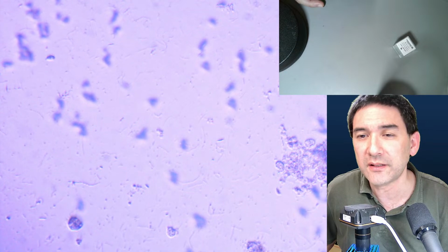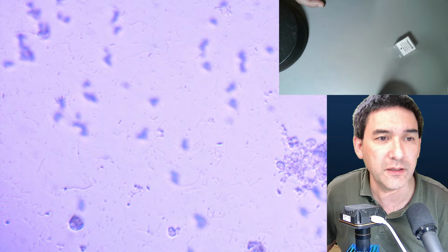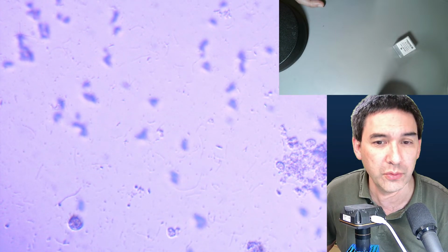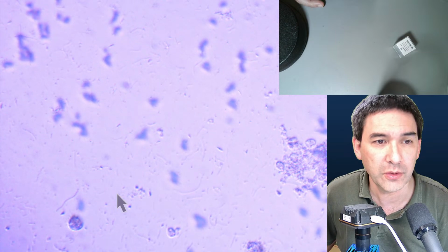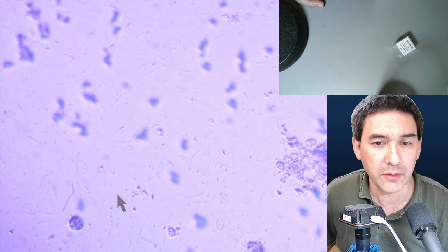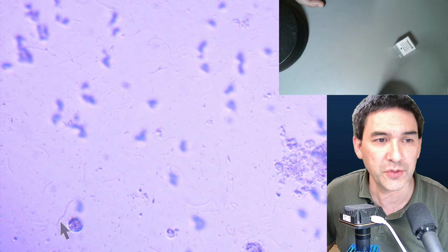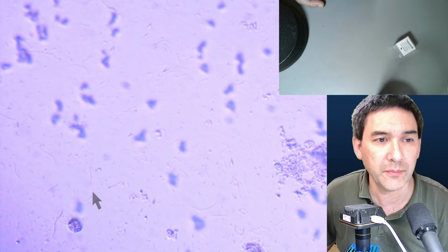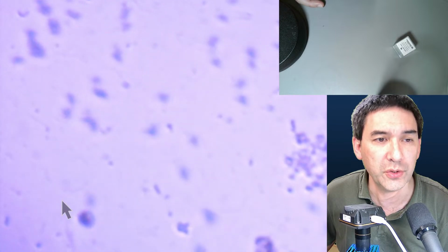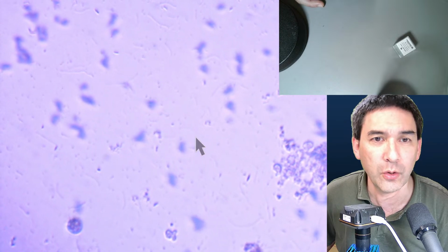How do you recognize that they are bacteria? Bacteria have specific size and also shape. So maybe I'm going to show you over here. I'm going to turn on the arrow over here. I cannot move the arrow here. Do you see this long thing here? That's almost certainly bacteria. Very characteristic, but the contrast is not very good. But still, it shows that it is possible to see bacteria even with this homemade microscope.